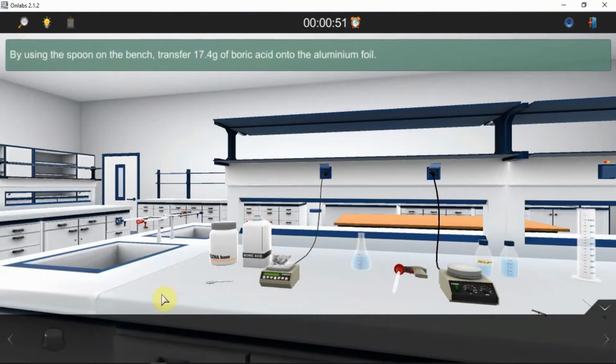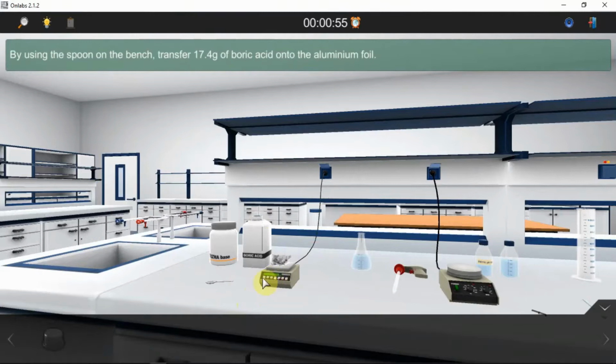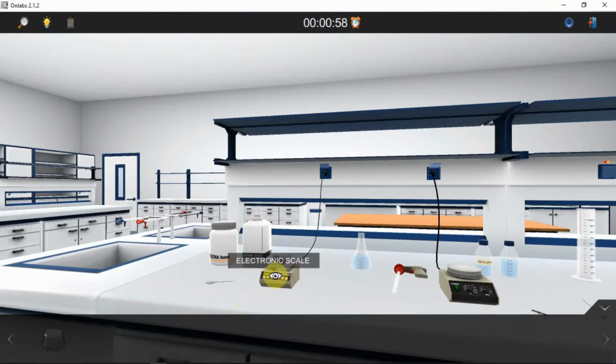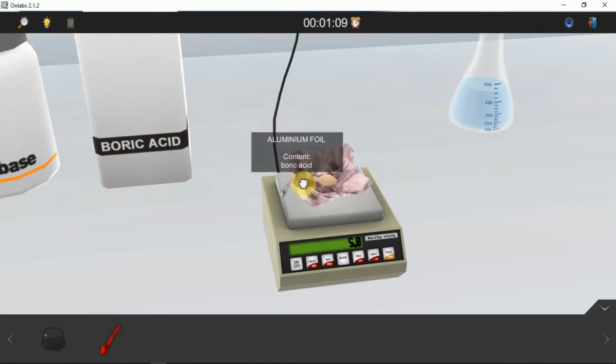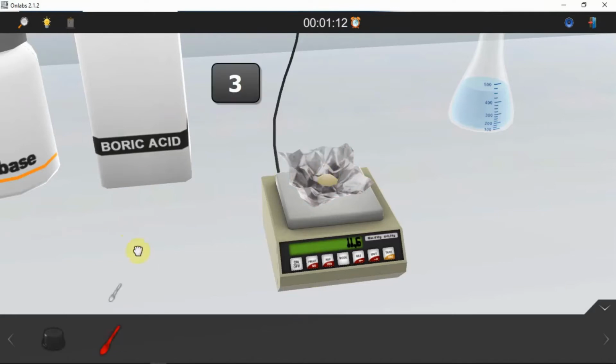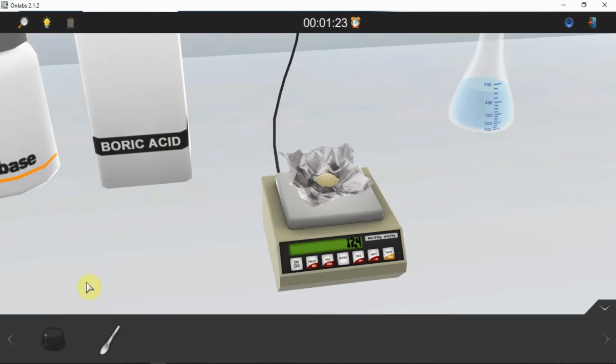Well done. By using the spoon on the bench, transfer 17.4 grams of boric acid onto the aluminum foil. Well done. You've just weighed 17.4 grams of boric acid. Place the cap back on the boric acid bottle.